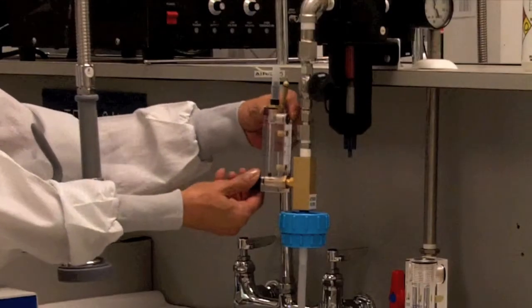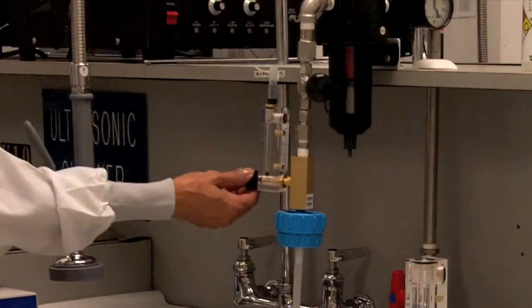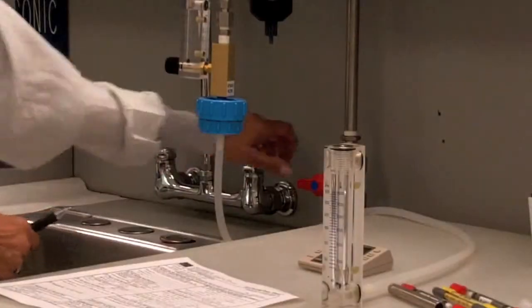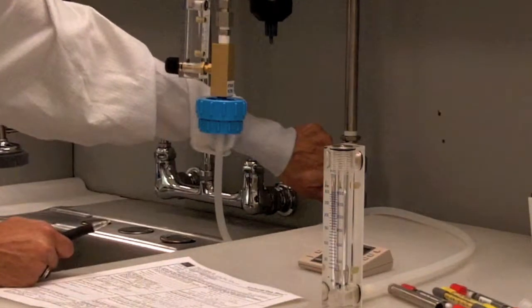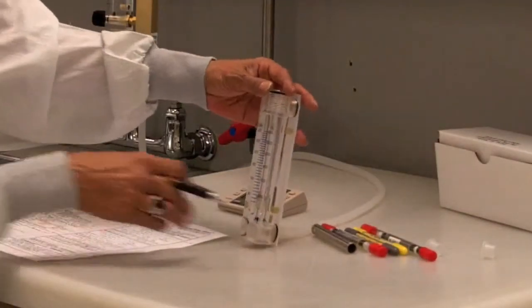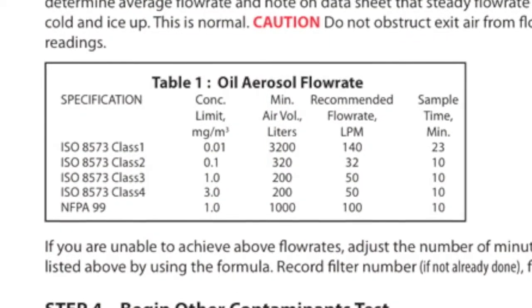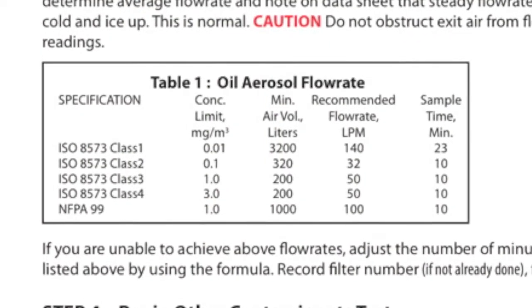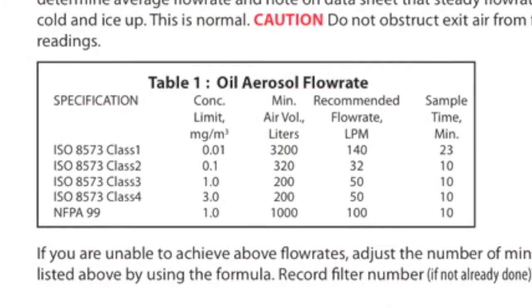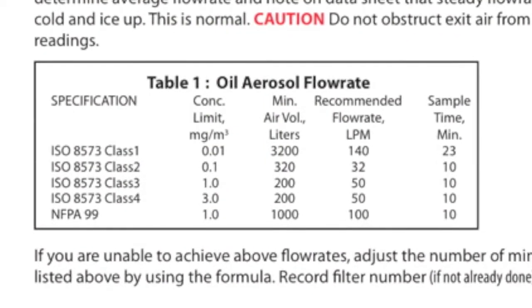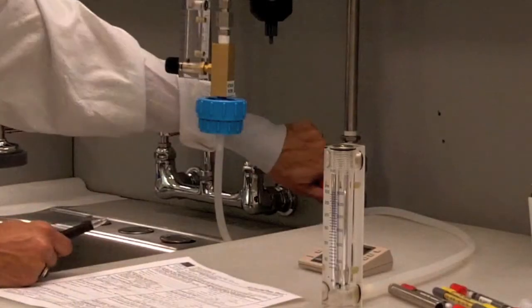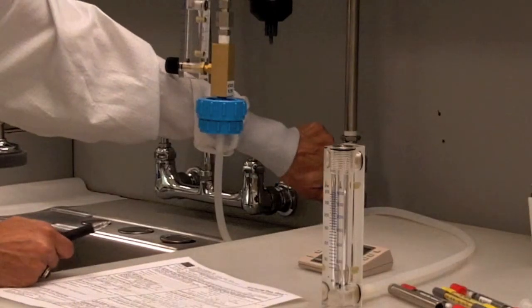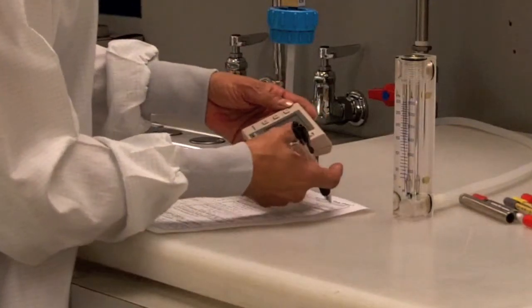Make sure the needle valve on the tube flow meter is closed. Slowly open your system valve to obtain the flow rate on the filter flow meter. Flow rates vary from 32.50 to 140 liters per minute. Adjust air flow to obtain the correct flow rate for your purity class and begin the first timer.